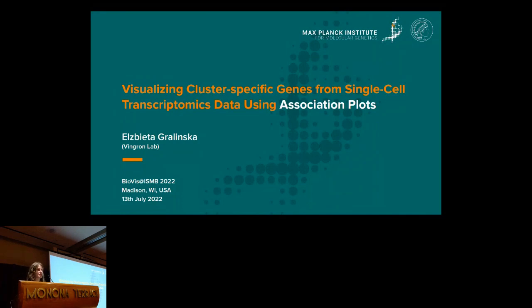And today I would like to present you our work on association plots, which is a method for visualization of cluster-specific genes from high-dimensional single-cell transcriptomics data.